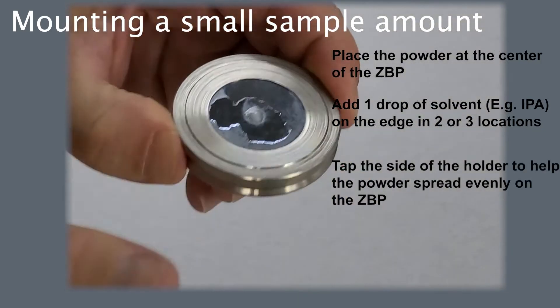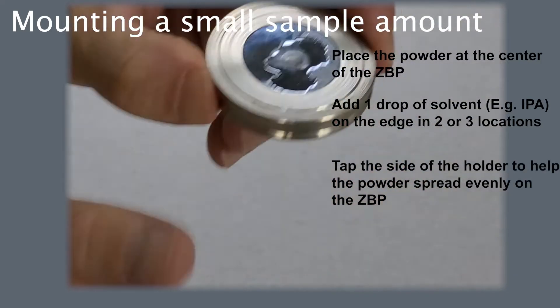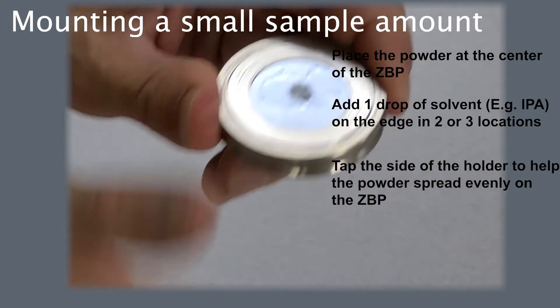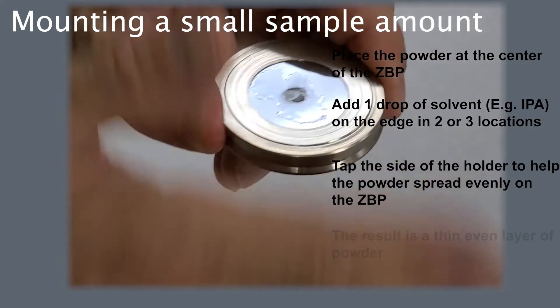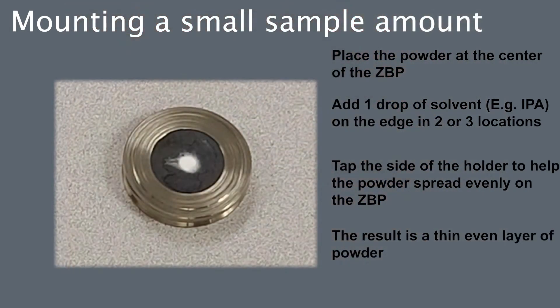Tap the side of the holder, rotating the holder, to get an even spread of the sample. The result should be a very thin layer of powder sample.